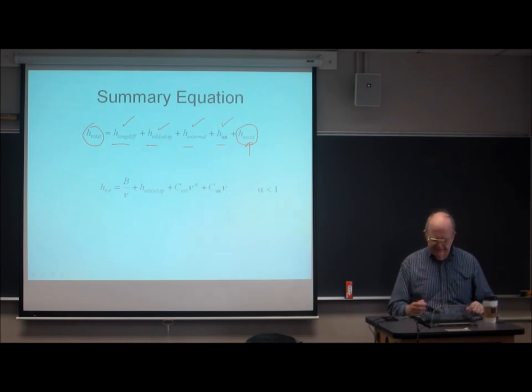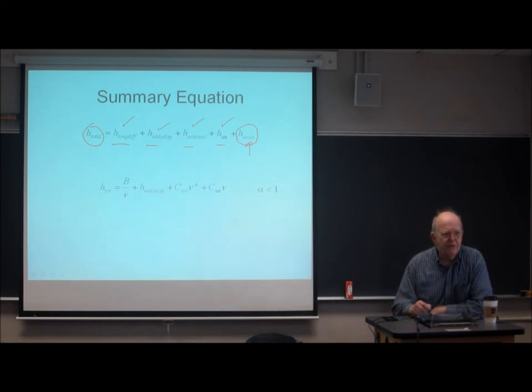And as I said some weeks ago now, as the columns get smaller and smaller, and they get smaller because we want to do faster and faster chromatography, and faster means smaller, this gets worse and worse and worse. And we need better and better equipment, and we have to do things more and more carefully.